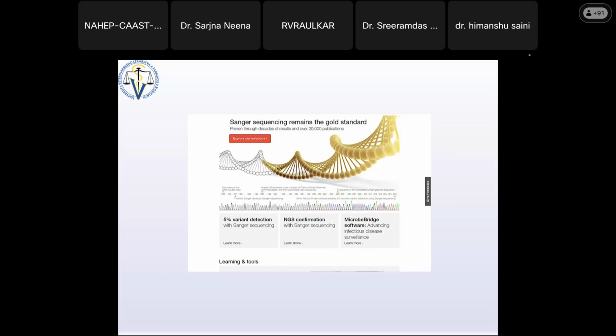In case of proteomics, for example, you have MALDI-TOF, LC-MS/MS, Orbitrap, all multi-million dollar instruments. And whenever I was sending data to a good journal like the Journal of Proteomics or some basic journals, they were asking me, okay, show me data from SDS-PAGE.